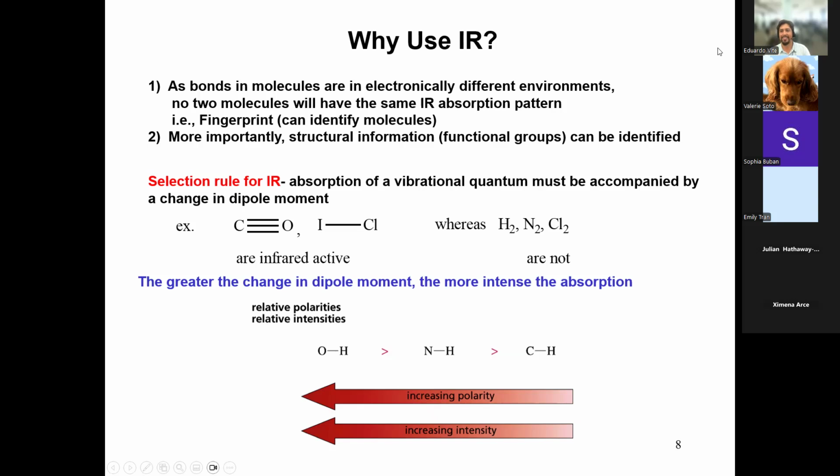Can you repeat the y-axis? Yes, I can. The y-axis measures the bond dipole change intensity. So for example, you can see here we say OH, right? We have oxygen on one end of the spring and hydrogen on the other end. Oxygen is more electronegative. Let me see if I can draw this out. I tried to use my tablet today, but I couldn't, so it's going to be a little difficult. So I'm just going to draw the dipole arrow right here. Oxygen is more electronegative, so the dipole points towards the more electronegative element, oxygen.